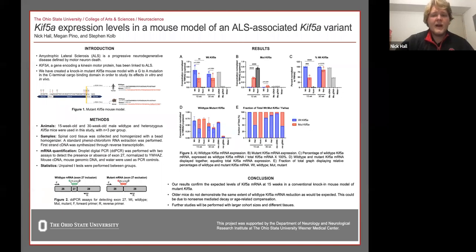The primers and probes bind to the cDNA, and during amplification, as the polymerases move along the template strand, the probe is kicked off and emits a specific wavelength of light that is measured by a machine. We can then quantify the number of positive transcripts that contain the probe and negative transcripts that did not. We also quantified mRNA production of another gene, YWHAZ, which is expressed in all cell types and thus is a good normalizer for gene expression.